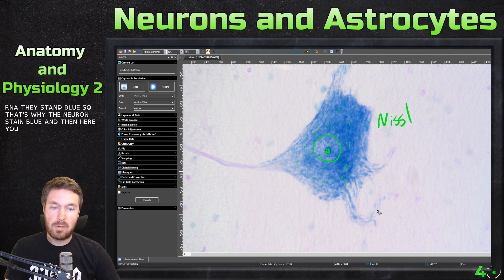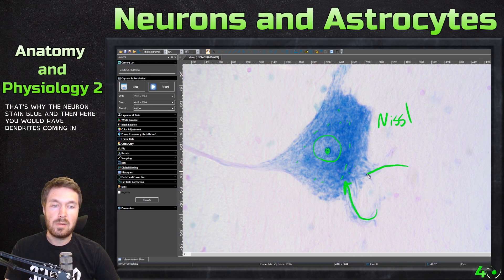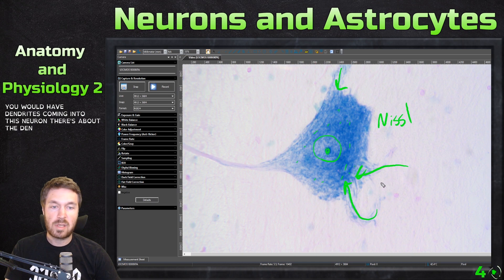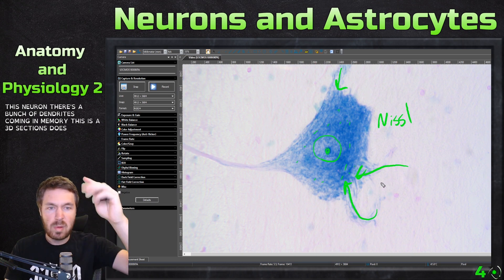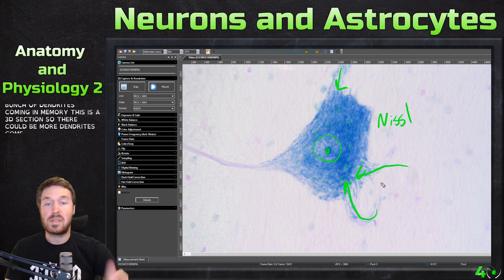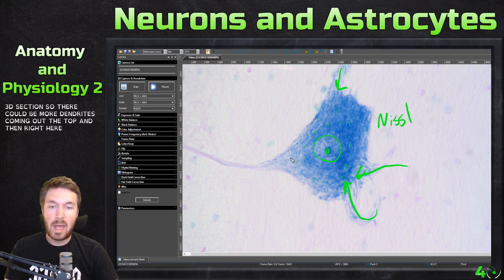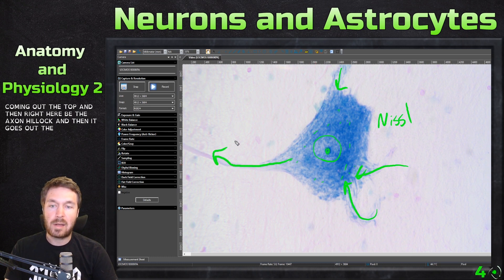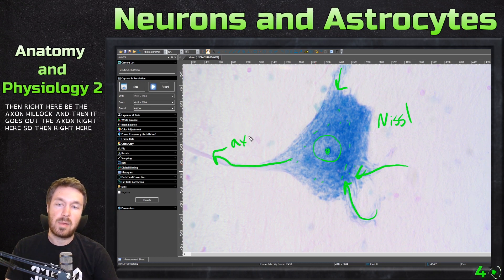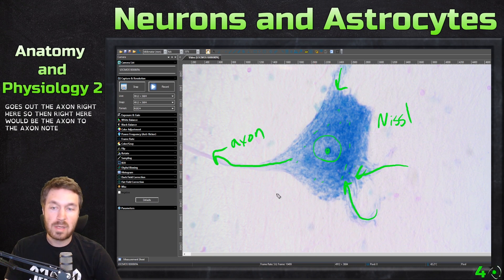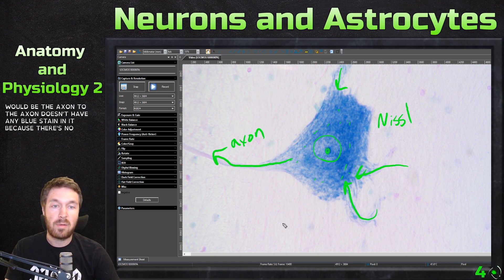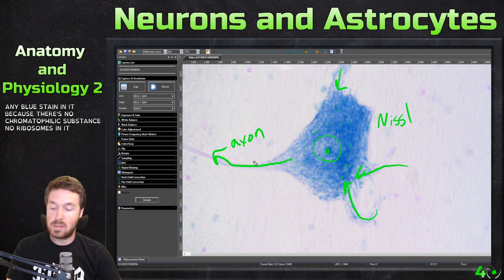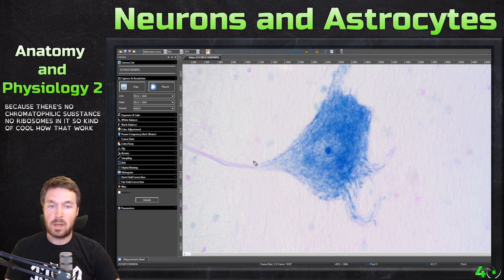And then here you would have dendrites coming into this neuron — a bunch of dendrites coming in. Remember, this is a 3D section, so there could be more dendrites coming out the top. And then right here would be the axon hillock, and then it goes out the axon right here. The axon doesn't have any blue stain in it because there's no chromatophilic substance, no ribosomes in it. Kind of cool how that works.